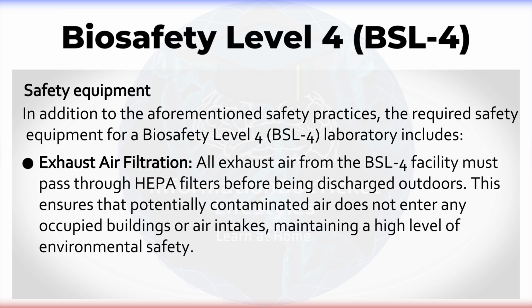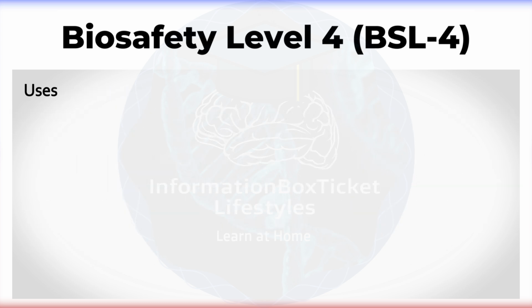Exhaust air filtration. All exhaust air from the BSL-4 facility must pass through HEPA filters before being discharged outdoors. This ensures that potentially contaminated air does not enter any occupied buildings or air intakes, maintaining a high level of environmental safety. Uses.